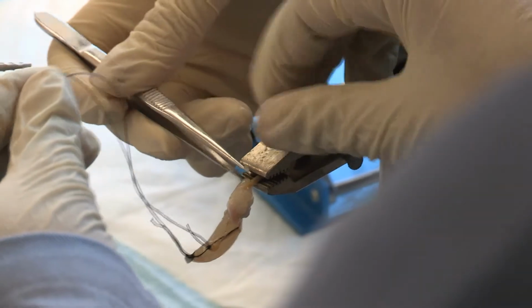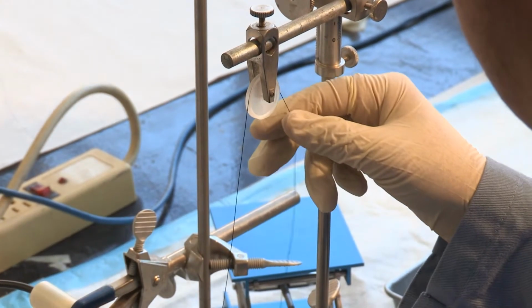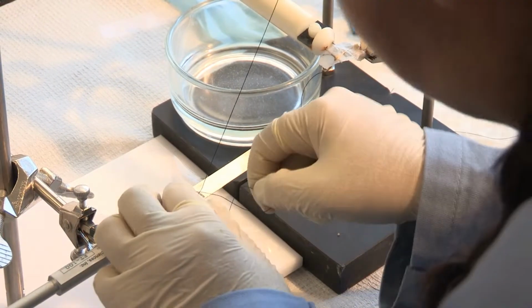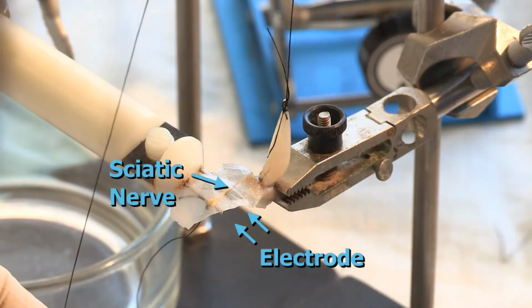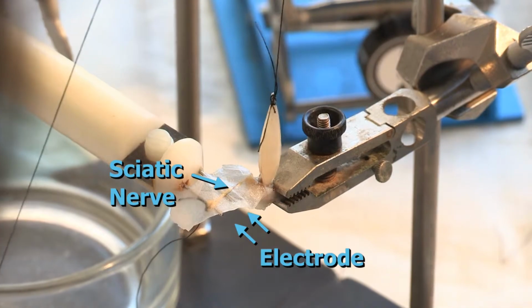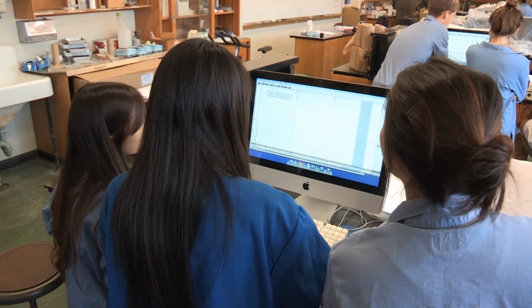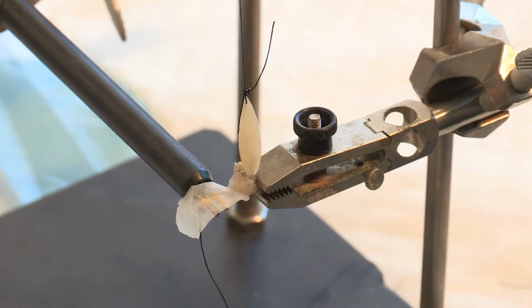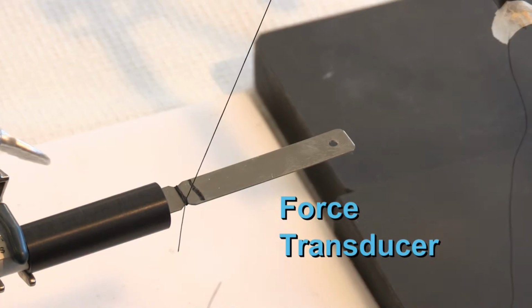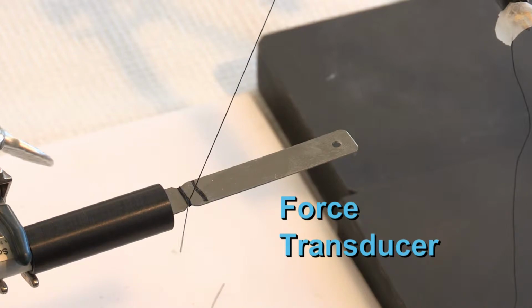We will clamp down the femur to immobilize the muscle. The string is run over a pulley and then tied onto the blade of a force transducer. The sciatic nerve is gently placed on a stimulating electrode, which will drive the current into the sciatic nerve. Using a computer program, we can stimulate the sciatic nerve and watch as the muscle contracts. The force transducer will detect the stretch and measure the amount of force necessary to cause this deflection.